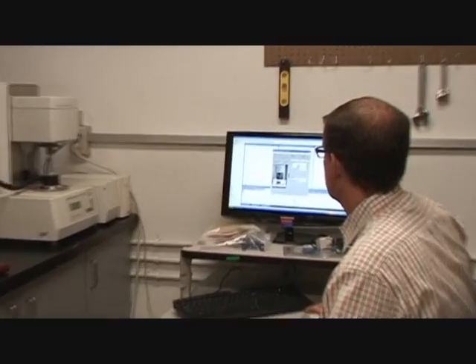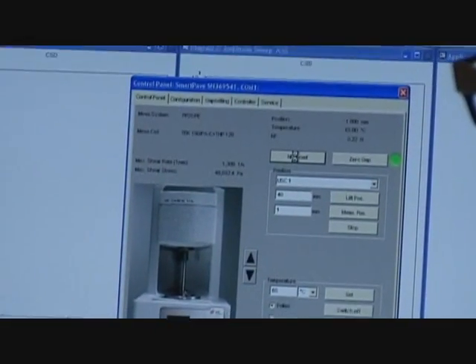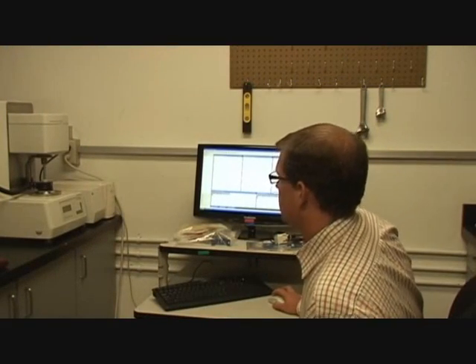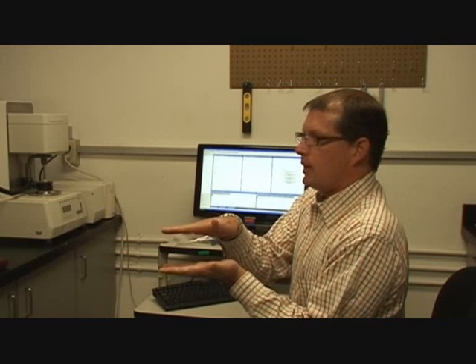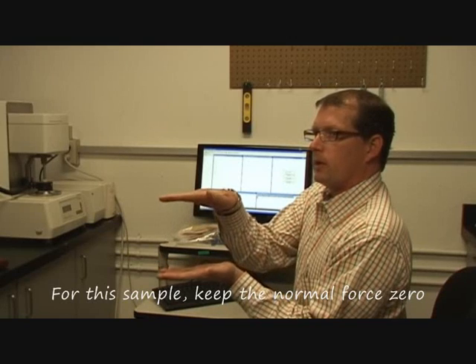It's a little low normal force now, so I'm just going to hit reset normal force. What I did was — I think when we go down to 25 degrees it's going to get really hard. It's going to push up and expand. So I'm going to do what's called running with normal force control. I don't want the sample to get too stressed sitting in there. So I'm going to say keep the normal force zero. As it starts to expand, the head should move up a little bit.